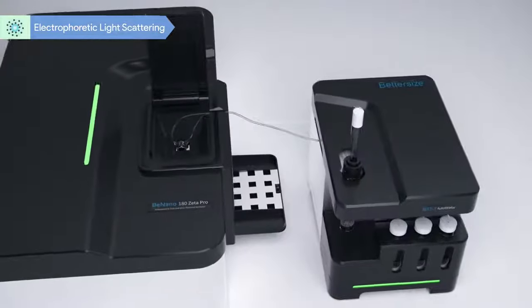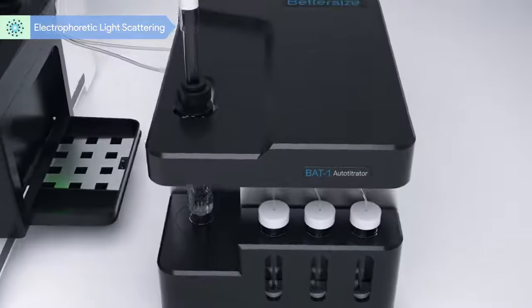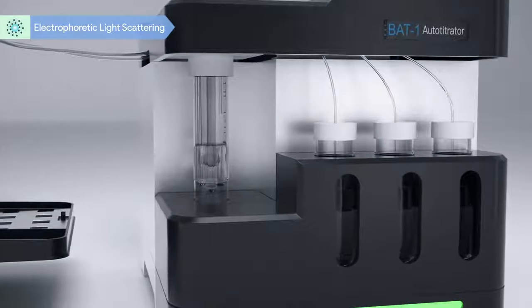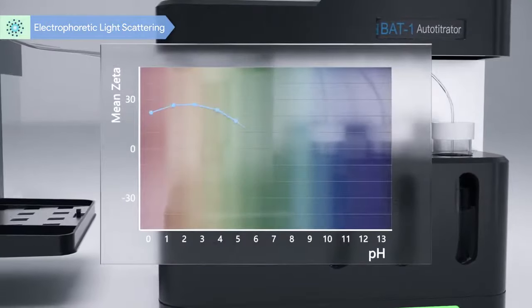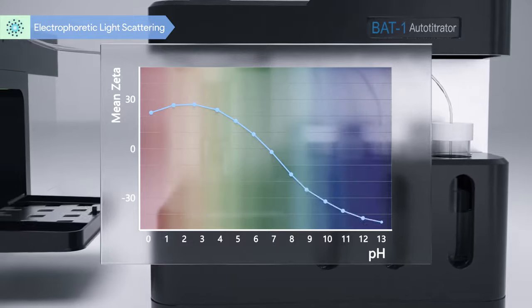The BAT1 autotitrator is designed to be used with B-Nano, performing automatic titration operation and offering a pH dependent zeta potential plot.